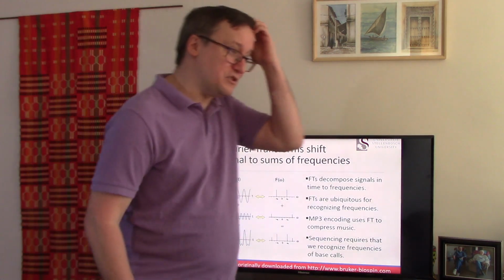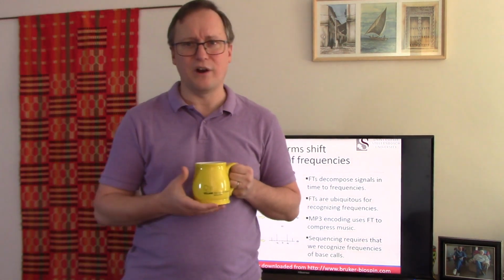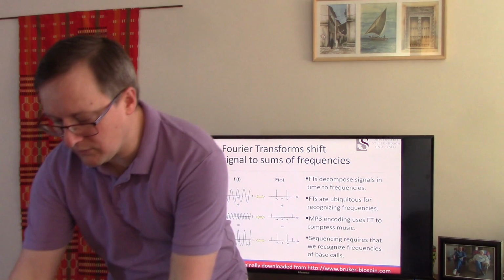Okay. So, let's now talk about frequencies. Frequencies are a frequent topic in all sorts of areas of bioinformatics, but this is an area where I think it's really easy to understand. When we looked at our electropherogram a couple slides back, we saw that there was a regular arrival and fall of peaks in our electropherogram as a function of time.